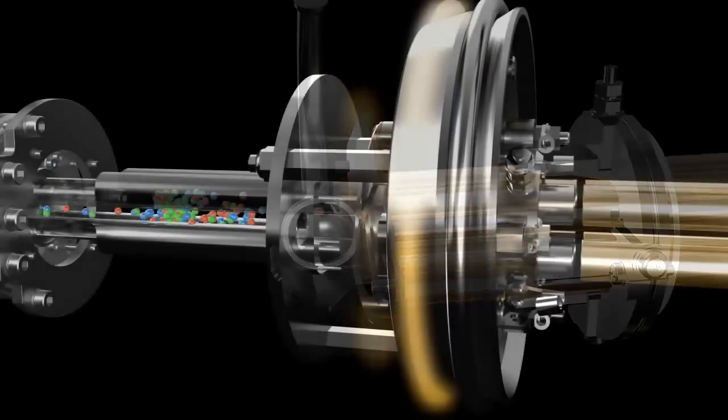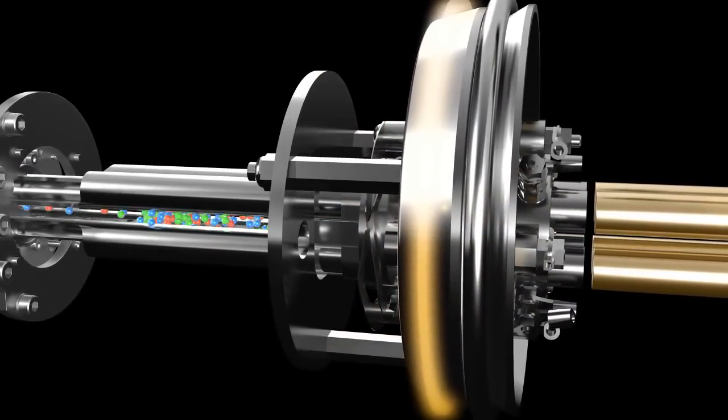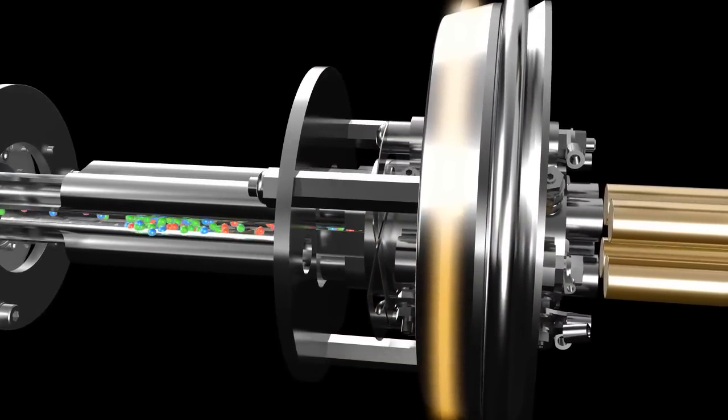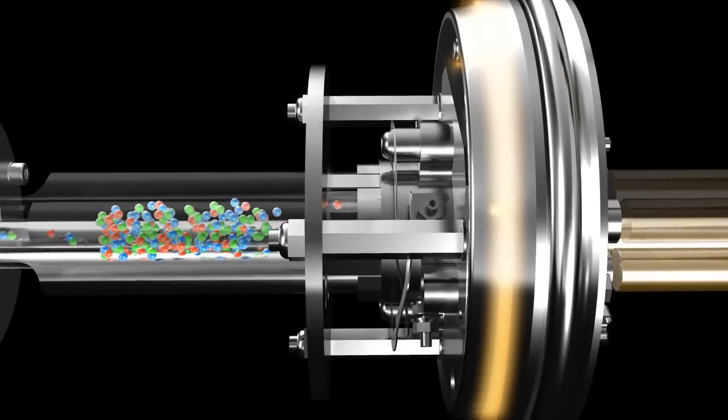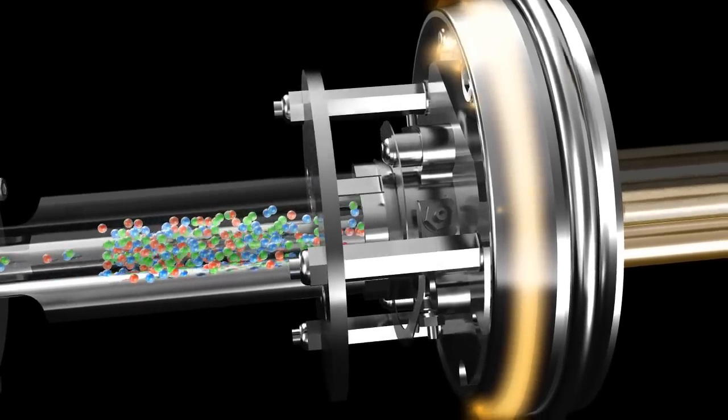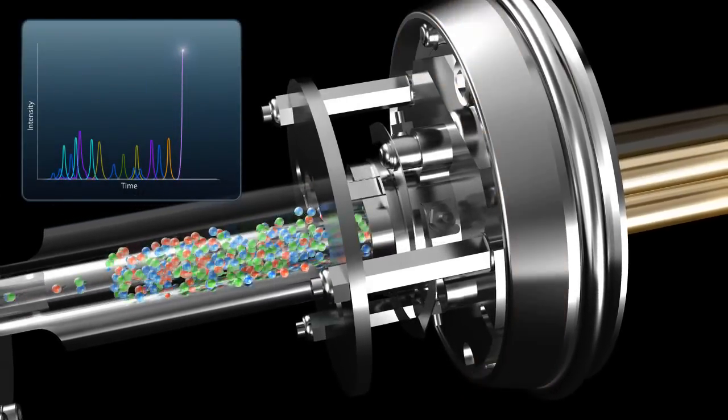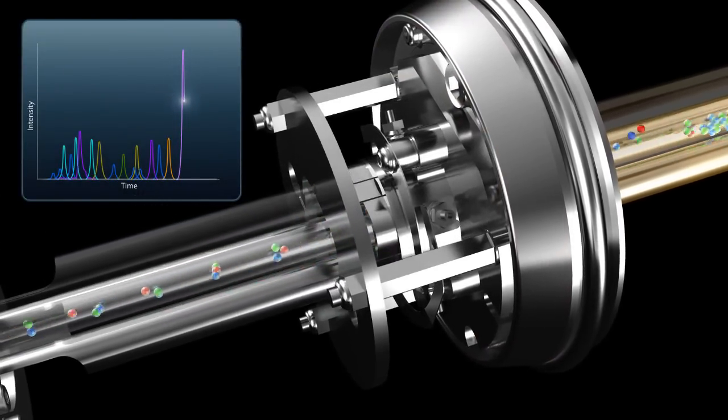During full-scan MS-MS acquisition, concurrent Q0 trapping is enabled to ensure you never miss anything eluding from your LC column. Once sufficient MS-MS data have been acquired, the system returns to MRM mode to detect the next transition.